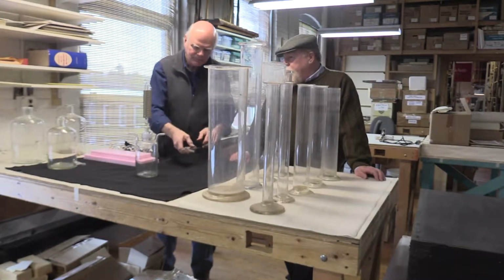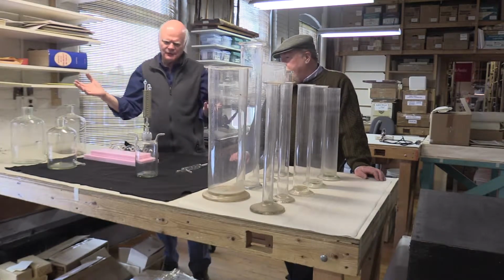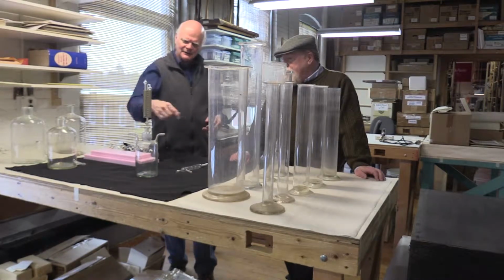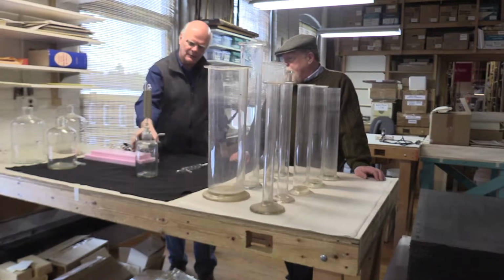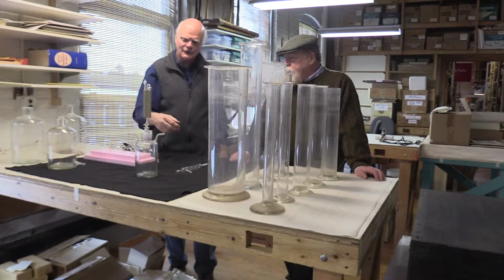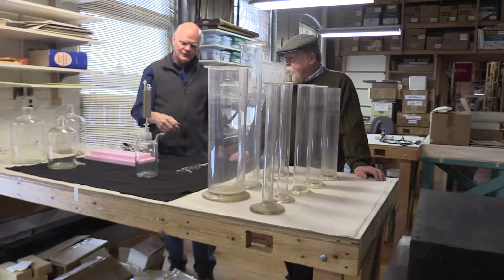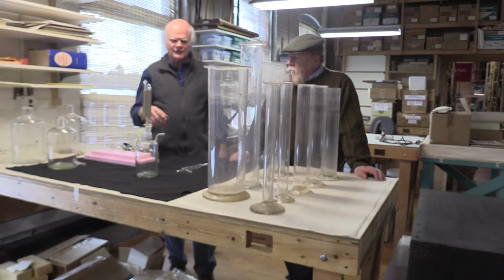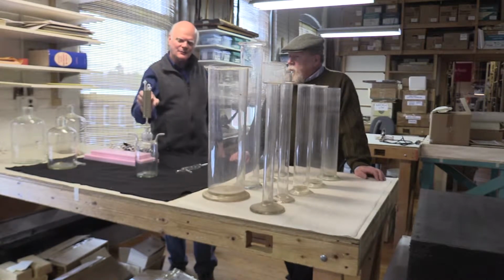And these are just works of art. Beautiful glass blowing. Somebody could make these so exact. Yeah, this was in a catalog, 1905 catalog. It's German, associated with the German chemist Kolbe. And Kolbe's name comes up in organic chemistry quite a bit. So it's interesting to see his apparatus.